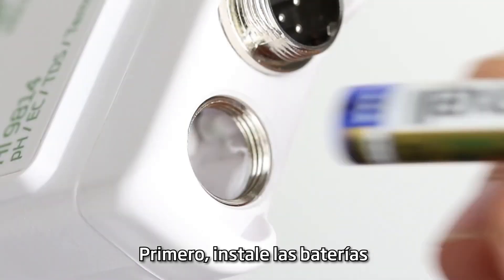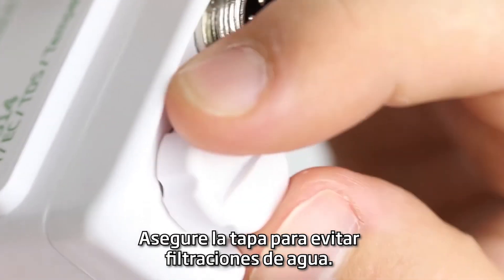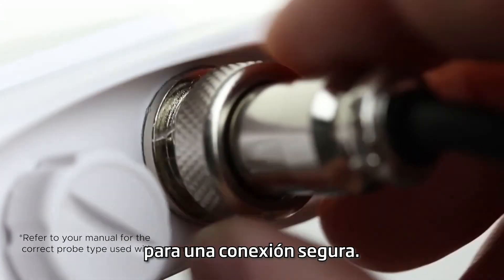Getting the meter ready to use is easy. First, install the batteries. Be sure to tighten the battery cover to ensure water tightness. Next, connect the probe by aligning the pins and tightening the nut for a secure connection.